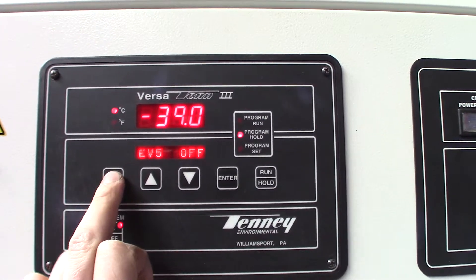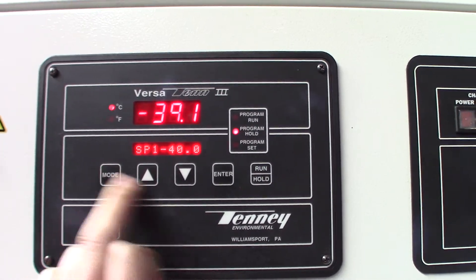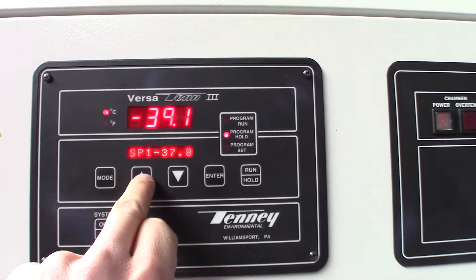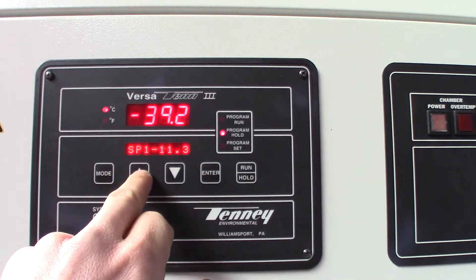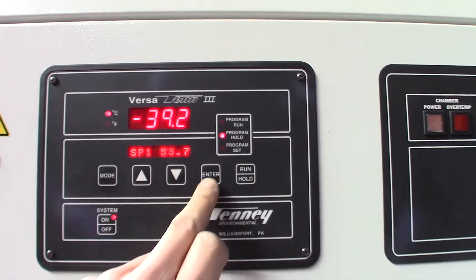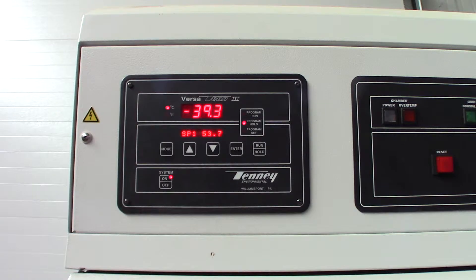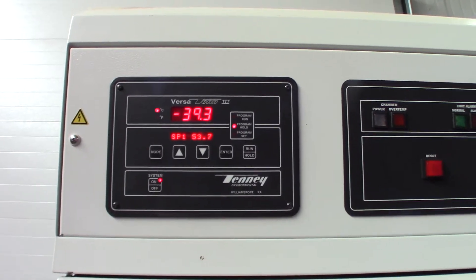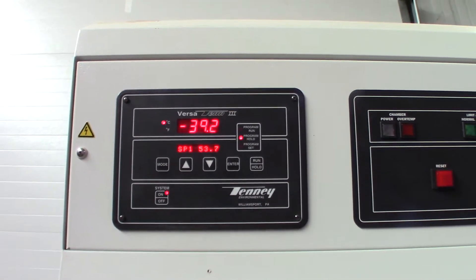All the events are off. At any point we could just change the temperature — say 50. As soon as you hit enter it'll start heating. You hear the compressor kick off, and then the electric heaters will kick on and it'll start warming up.